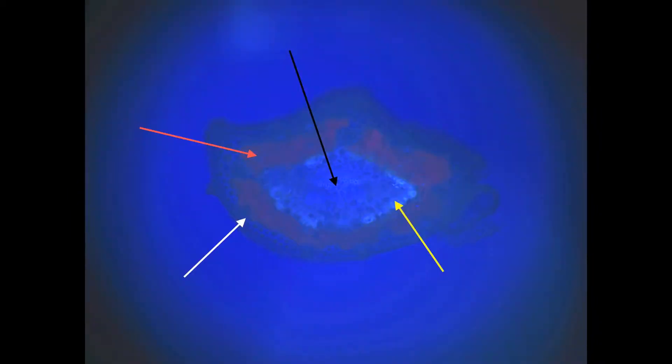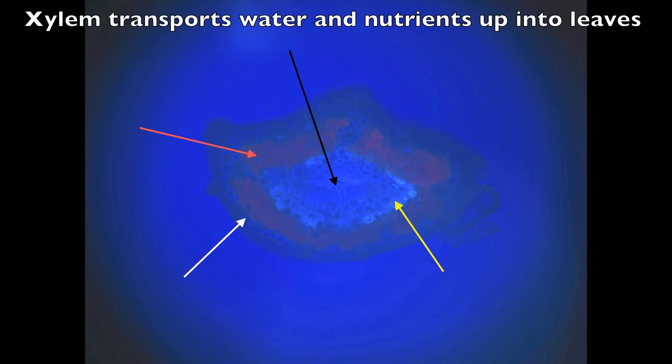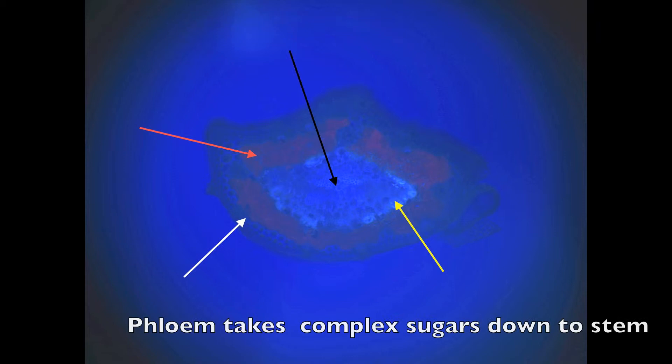So now we've switched to fluorescence with the same specimen. And it looks dramatically different. Notice that all the bubbles in the center have gone away. They're invisible under the fluorescence. And you can see the beautiful tissues that show up there. The black arrow is pointing to the vascular bundle, the xylem and the phloem. The yellow arrow is pointing to those resin canals we talked about. And the red arrow is pointing to the chloroplasts which were green and now they're glowing bright red. And you'll see them even brighter in another picture in a second.